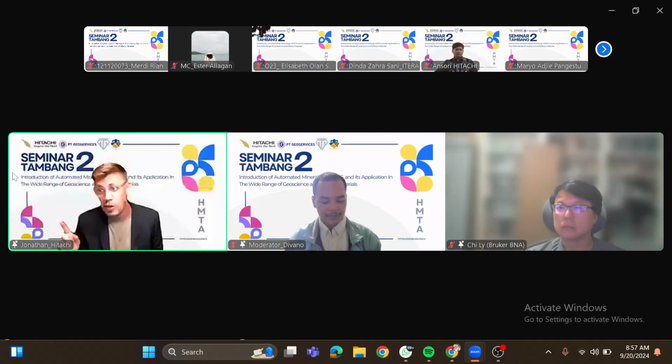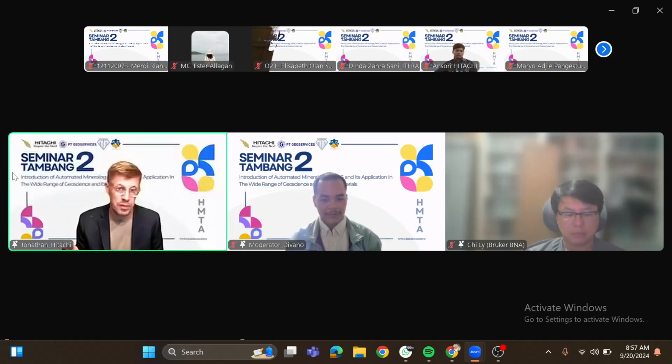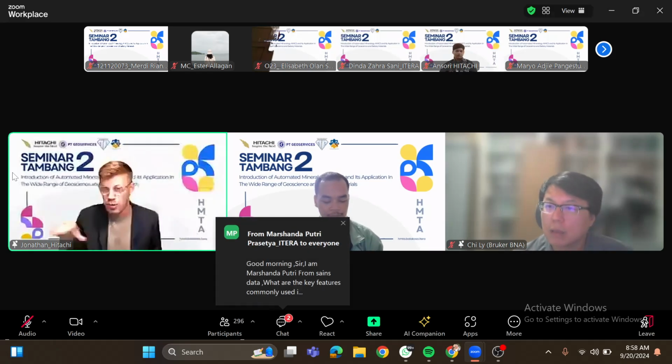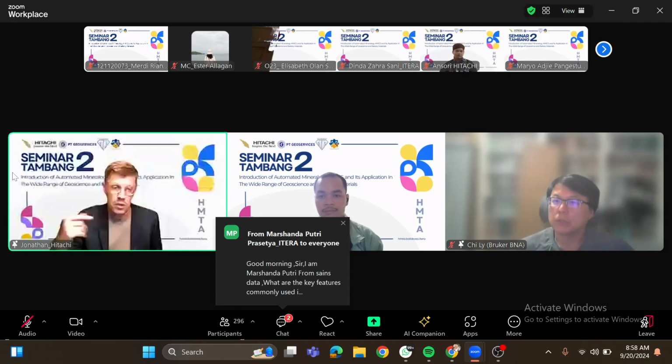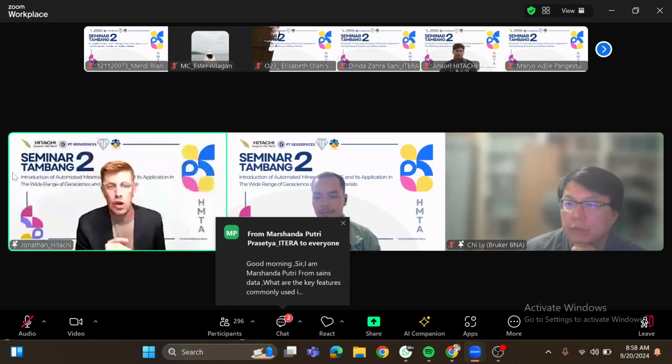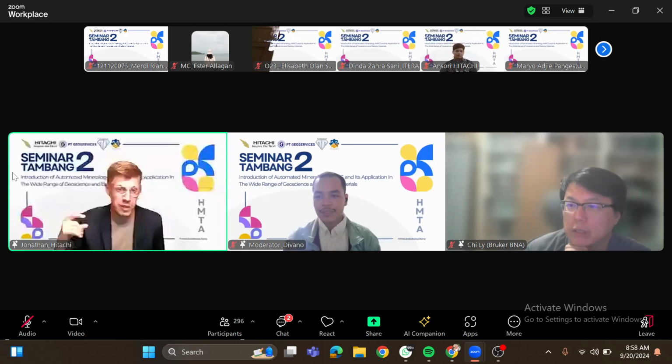Now, very importantly, is the next question. Also, can you explain how data is usually collected and integrated into the model to ensure accurate predictions? So the name of the game for everything we do is quality control. And what's important about what AMICS is doing is that it's using a programmatic approach instead of a machine learning model-based approach at that first level, right? So when we have new materials or minerals that show up, they show up as unknowns.